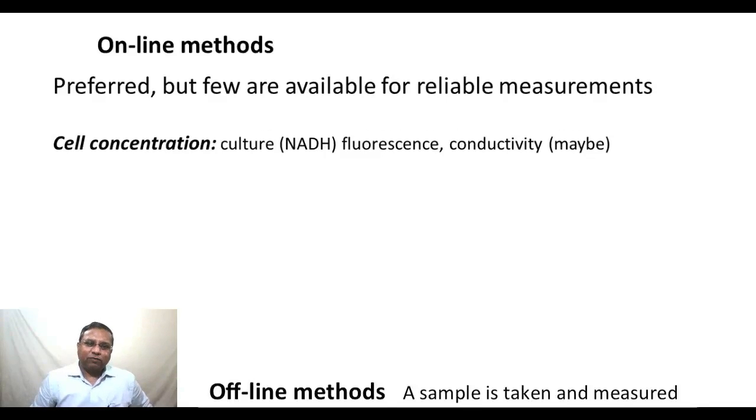The conductivity of cells can also be measured. There are some probes for it. The reliability, not so sure, maybe. That can also be used. That's an online method.